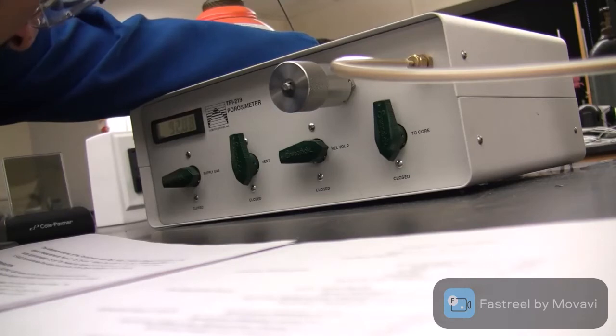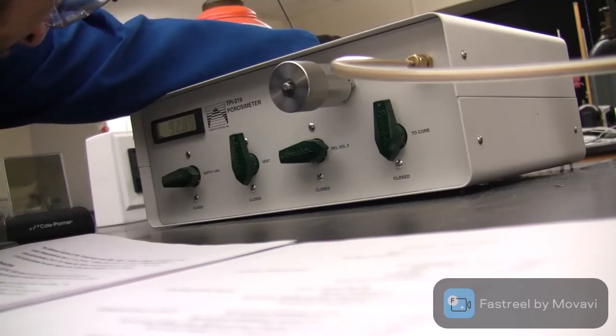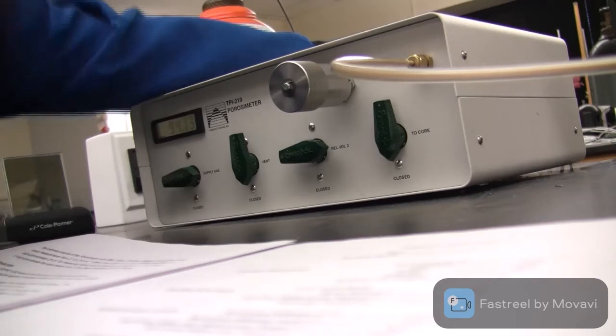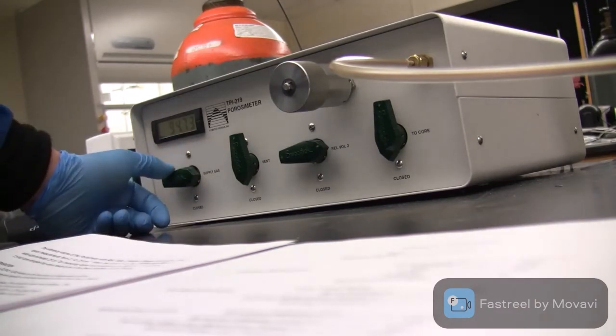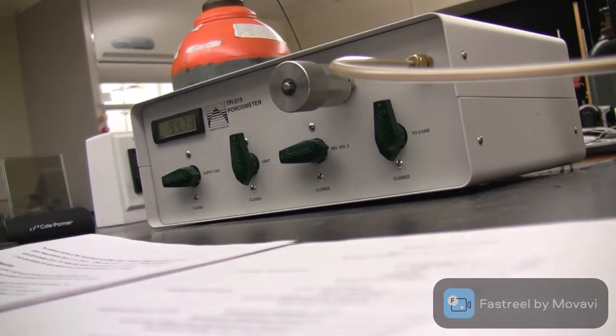I'm moving the knob slowly because I don't want to exceed the... Oops, now should be good. Okay, 94.73. So we wait for a few seconds, like 10 seconds or so, and then we close the supply gas valve.